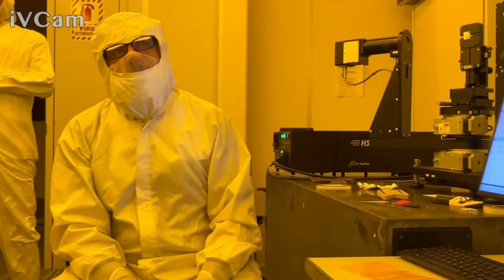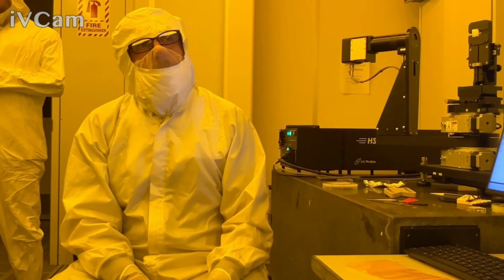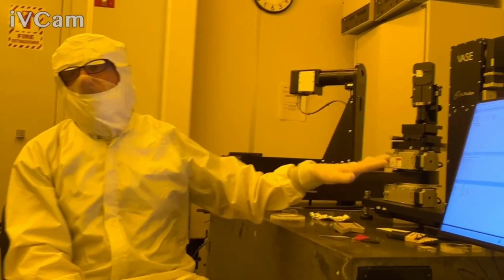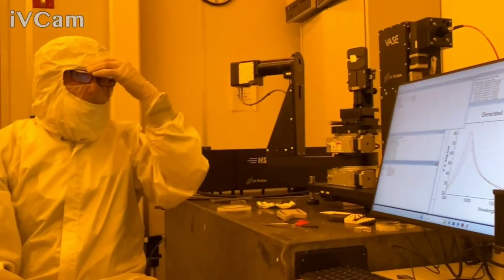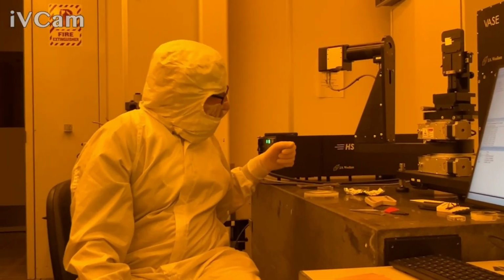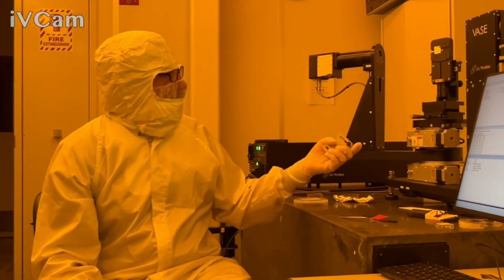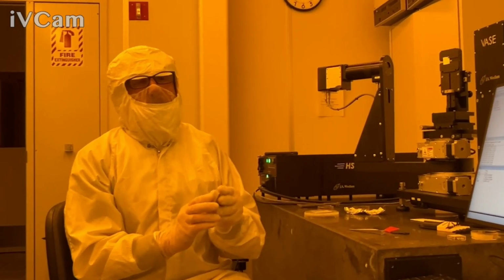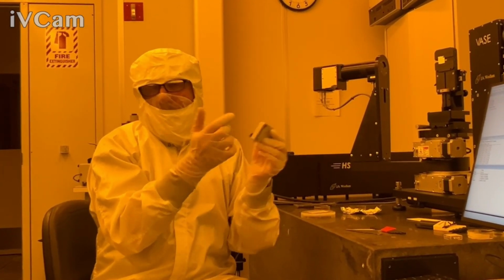If it happened during a measurement, the main thing is you'd lose power to the vacuum, so your sample would fall. Sometimes it helps to use a shelf. The thing I was using as a shim, when I wasn't realizing that 3D printed part was there, is a shelf. If you're always mounting the same sample on there, you can mount this as a shelf, and that sometimes stops it from falling.